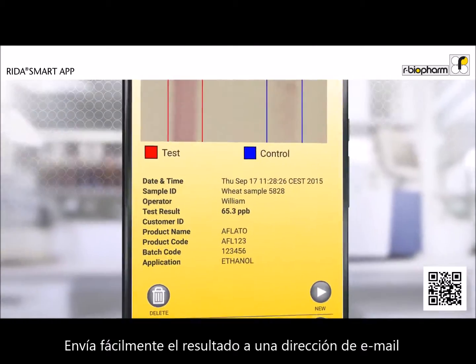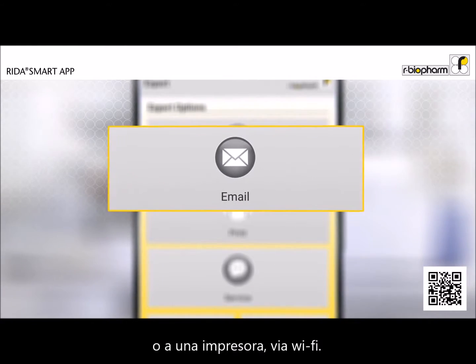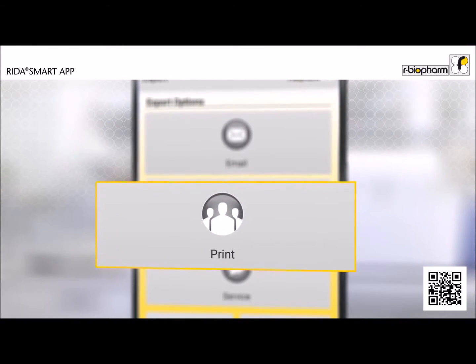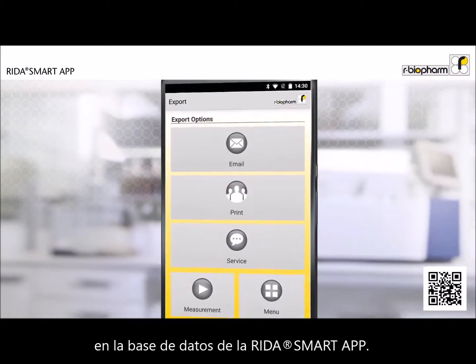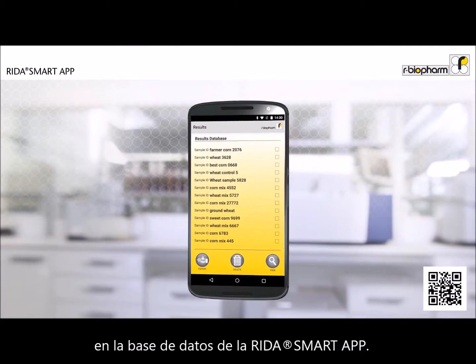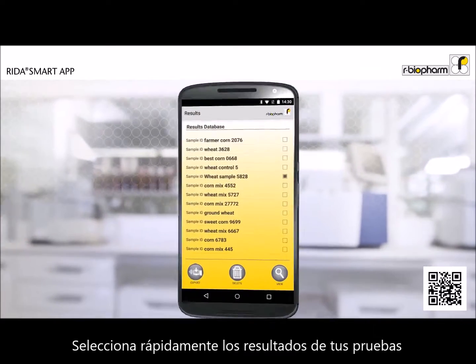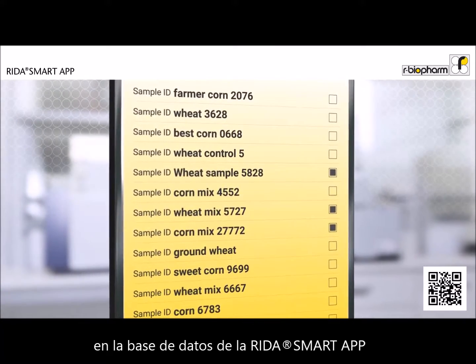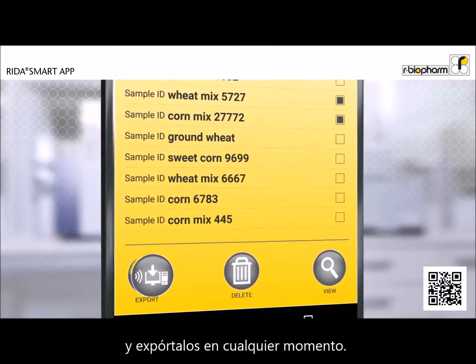Easily send your test results to an email address or to a printer via Wi-Fi. The results are automatically saved in the RIDAR Smart App results database. Quickly select your test result in the results database and export them at any time.